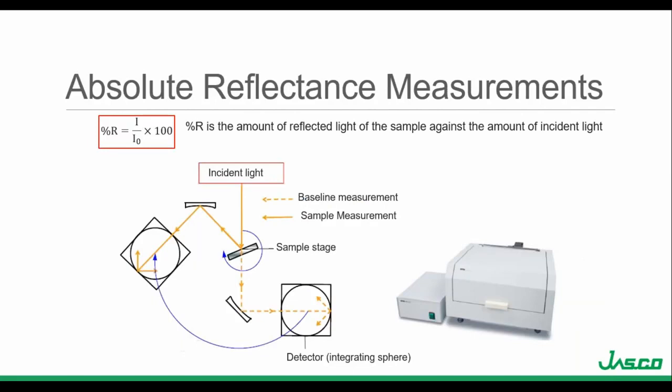The absolute reflectance accessory uses a light source having a known output as the reference to calculate the sample's known or absolute reflectance. Absolute reflectance measurements can be used to obtain both transmittance and reflection data by changing the incident angle and or the detection angle.